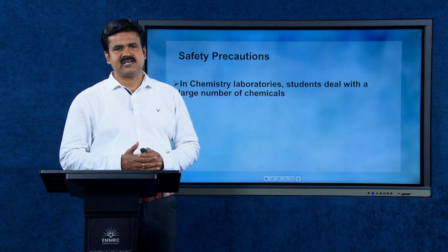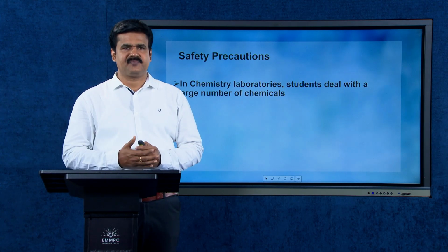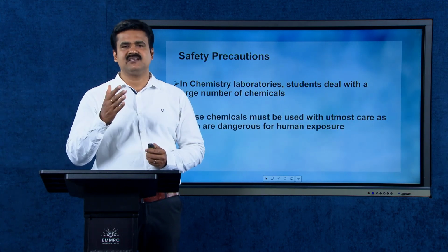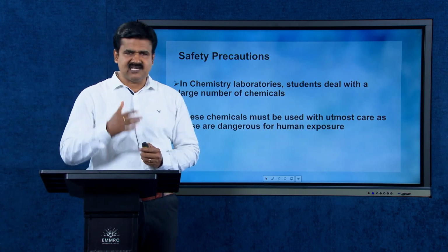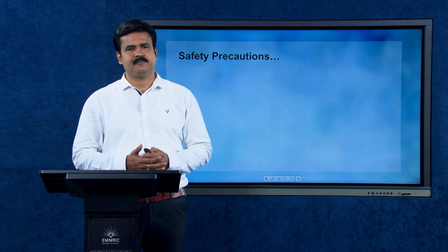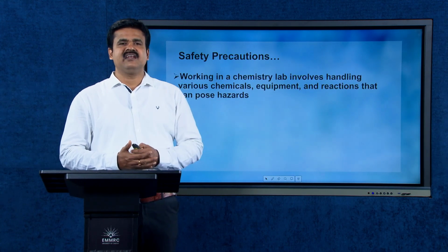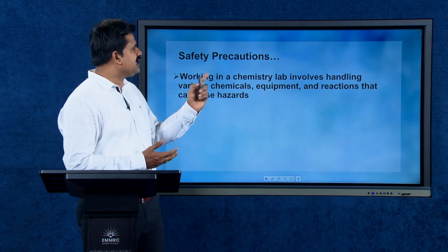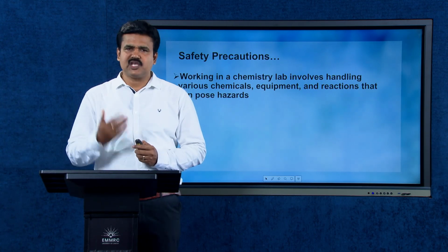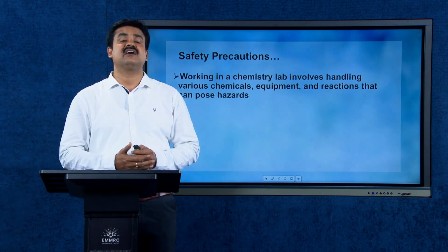In a chemistry laboratory, students deal with a large number of chemicals. These chemicals must be used with the utmost care as they are dangerous for human exposure. Working in a chemistry lab involves handling various chemicals, equipments and reactions that can pose different hazards.